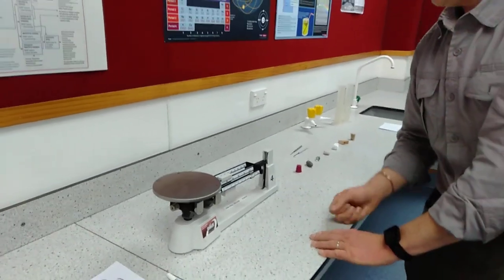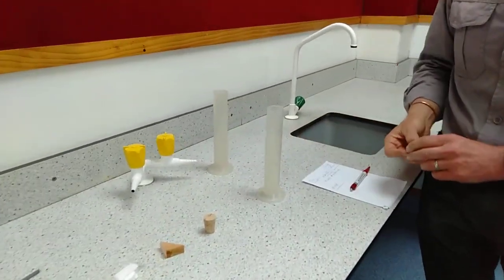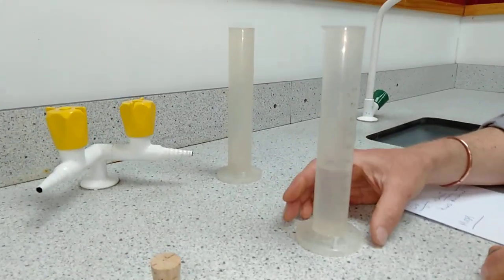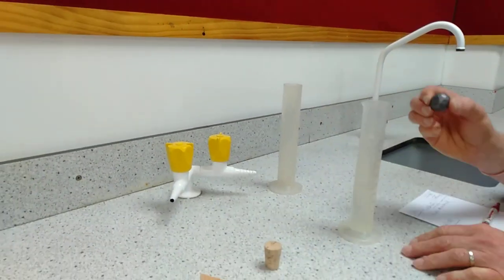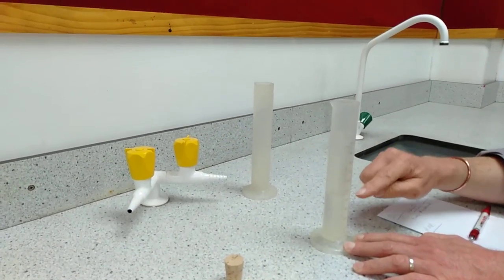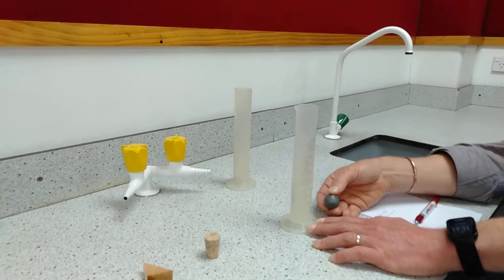Now that we have the mass, we need to work out the volume. We work out volume by displacement of water using a measuring cylinder. We can have a look. We have filled up the measuring cylinder to 50 milliliters. If we put the lead ball into the water, it will rise, and the change in the volume will be the volume of the lead, because that is the amount of water that the lead has displaced.